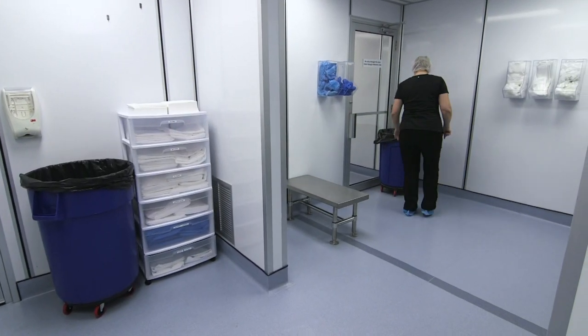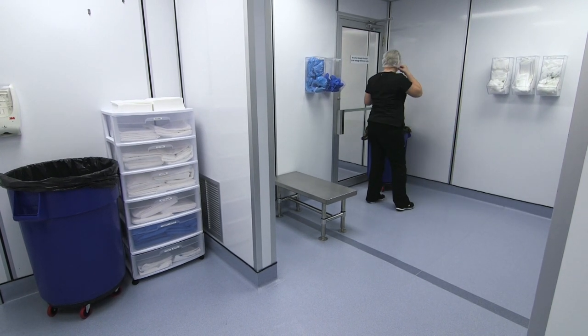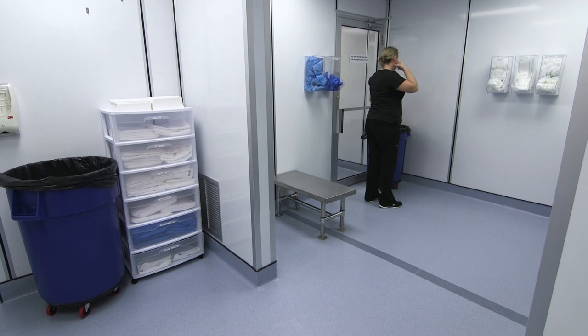Exit the anteroom by crossing the line of demarcation, then remove the last pair of shoe covers, face mask, bouffant cap, and beard cover if applied, and exit the anteroom.